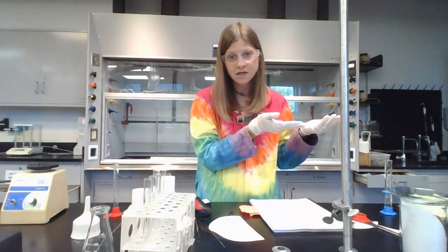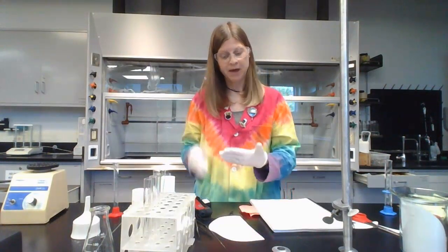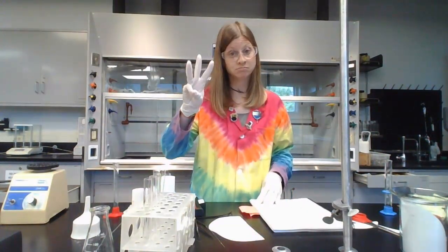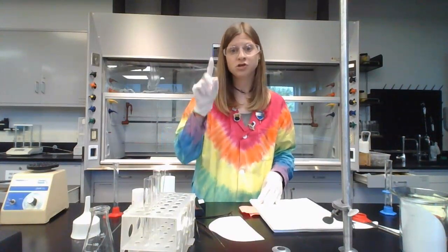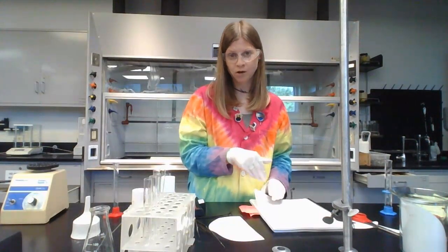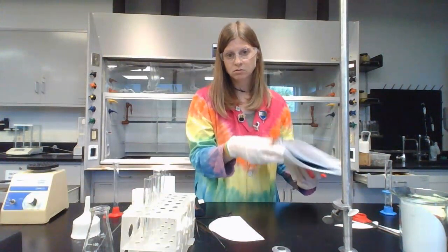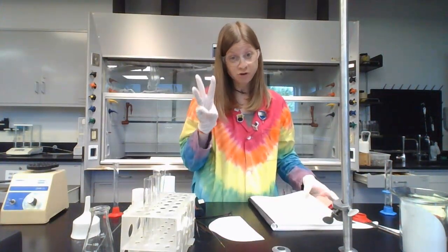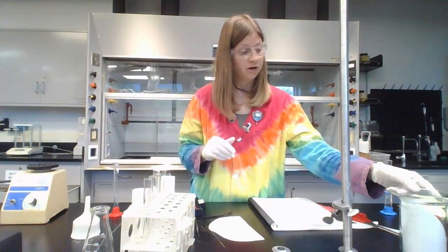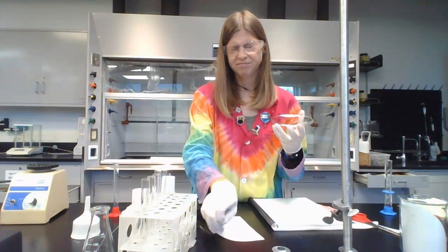for another 5 minutes to do a third weighing, take it out, cool it, put it on the balance, and measure the mass. So there are spots in your lab for 3 mass measurements from the oven. You have to do the first 2. You will only do the third one if you don't meet the 1% rule on that. Okay. Once you've either done it twice and met the 1% or done it the third time, you're going to record your numbers. You're going to take a little bit of the solid that would have been on your weigh paper or your watch glass.